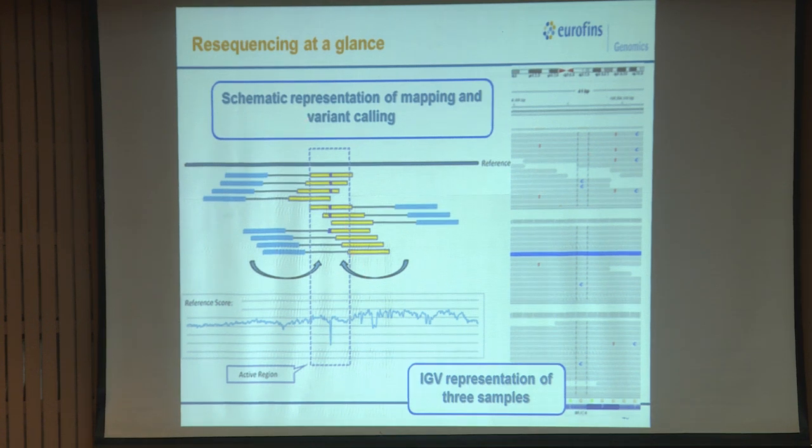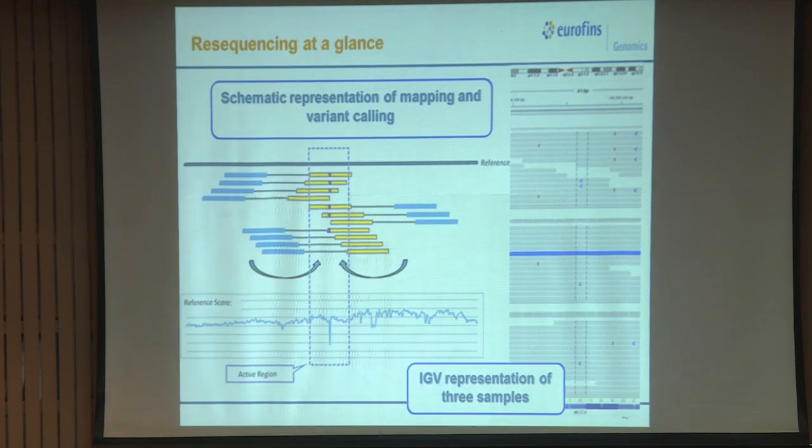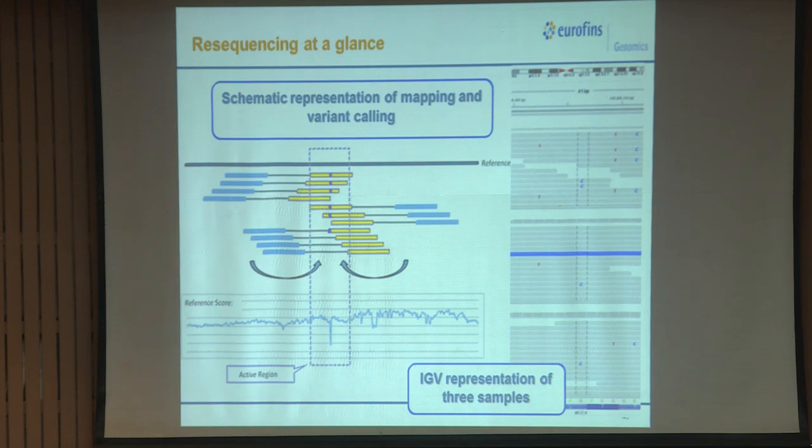Once we map the reads, this is mainly done for studying differences or SNPs. The main objective of doing this, if we want to find out SNPs, biomarkers, then we go for reference seq. So, if I find a region where my reference sequence has a base and this particular read has some other base, you can see a purple line tells me that there is a different base there.